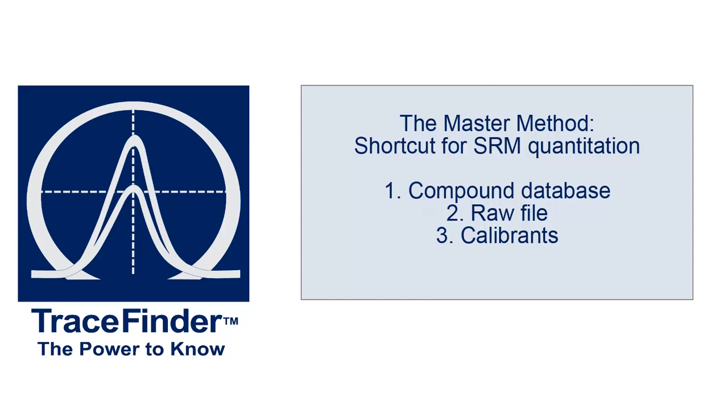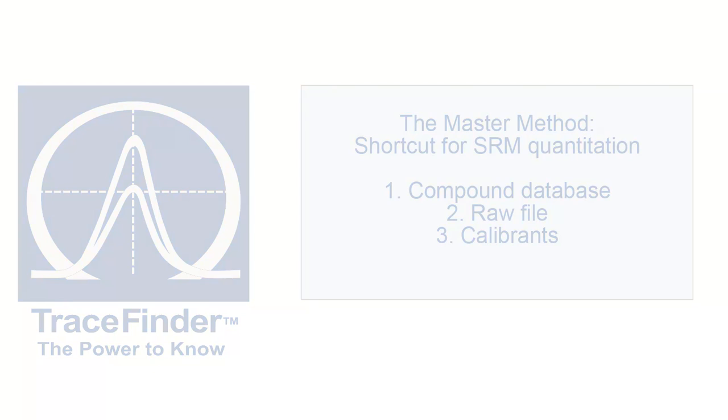In this video, we'll create a new master method by importing a compound database, a raw file from a triple-quadrupole instrument, and calibrant information.